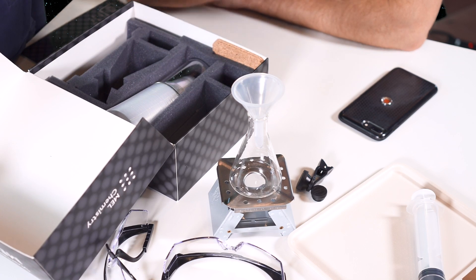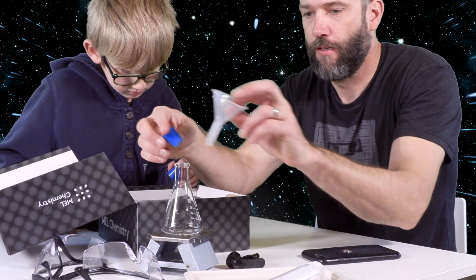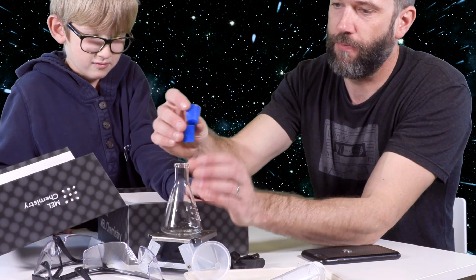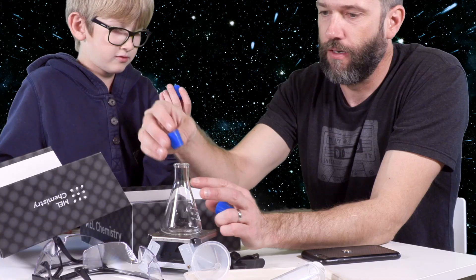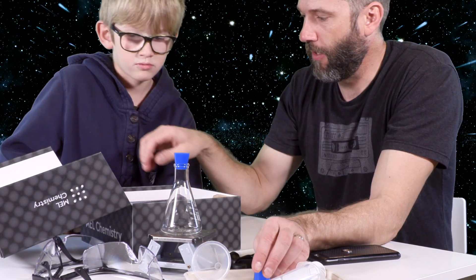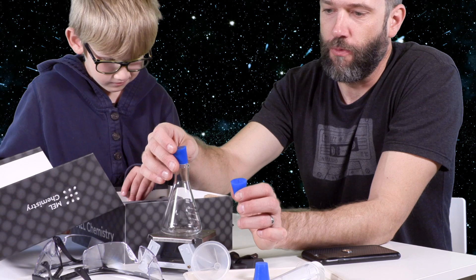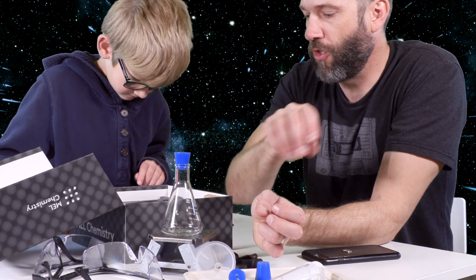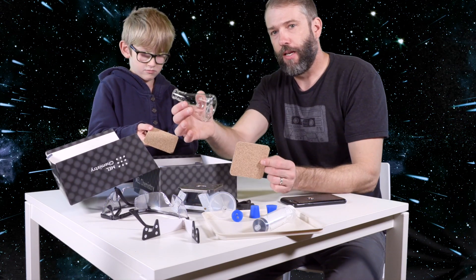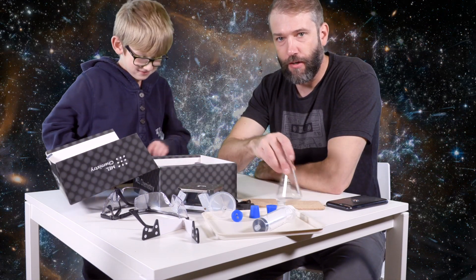So these are little rubber stoppers. This is a rubber stopper without a hole in it, and that can stopper up the flask. This is a rubber stopper with two holes in it, so you could maybe make a distillation setup where you have water going in and liquid coming out. And then this one just has one hole in it. Two cork trivets for when you heat the flask and then set it down without burning your table.